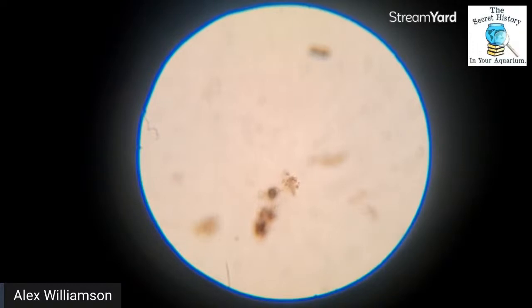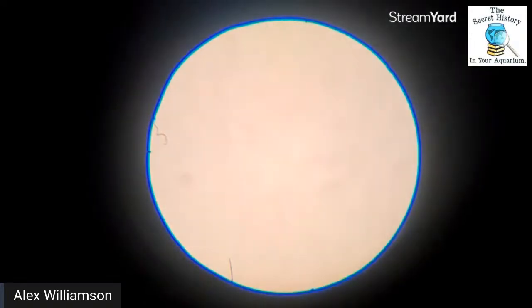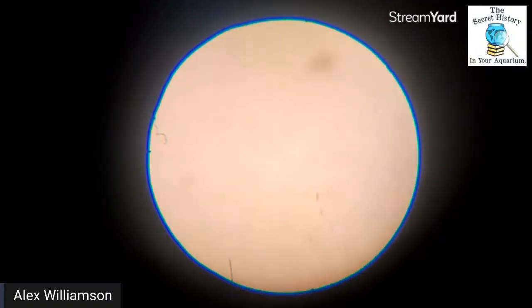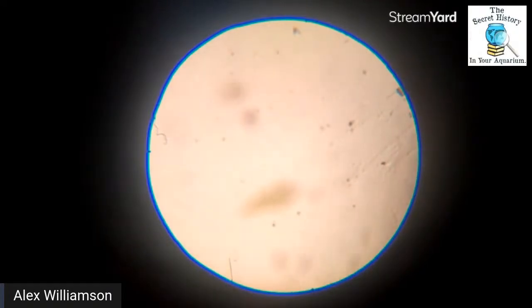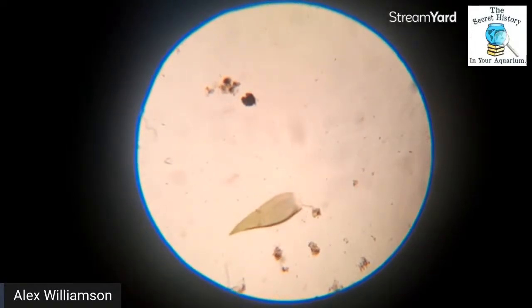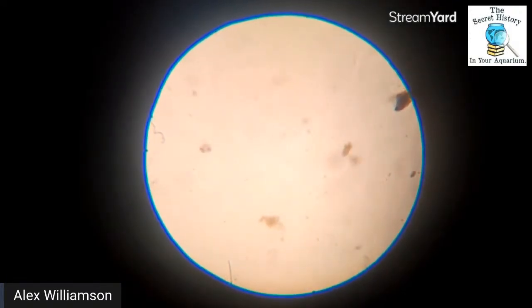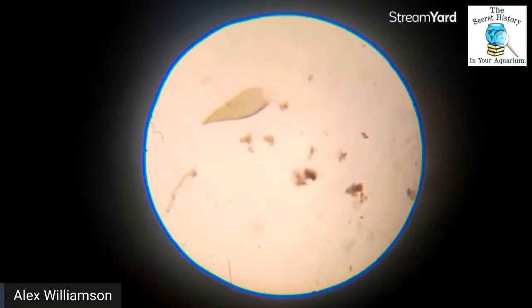So, okay, I think we see what's in this little puddle. Let's take a look at the next little eyedropper of water that I put on this slide. We're going to start zoomed out again. And here we have, again, just smuts, stuff from the bottom of the tub. To the naked eye, I see nothing. Literally nothing in here. But ta-da, once you have warmer waters, yes, there's stuff alive in cool water, but when you get warm water, tropical level waters, the life goes up exponentially.